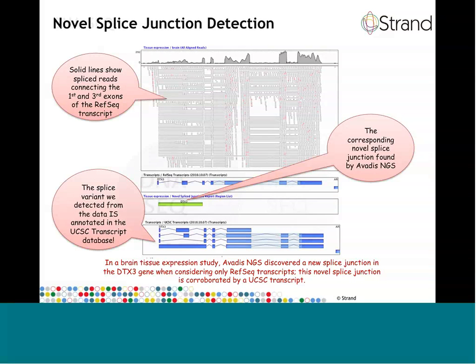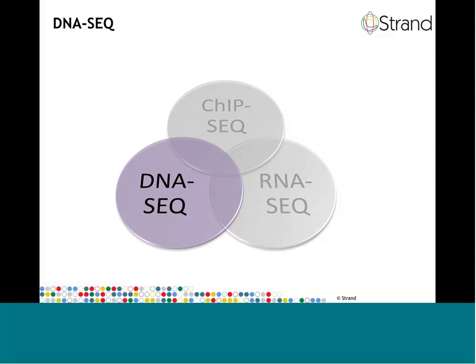So this concludes the section on RNA-Seq, and I will now spend a few minutes on the third supported workflow, DNA variant detection, or DNA-Seq.